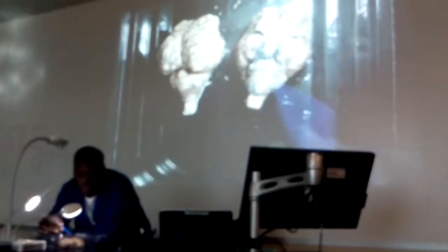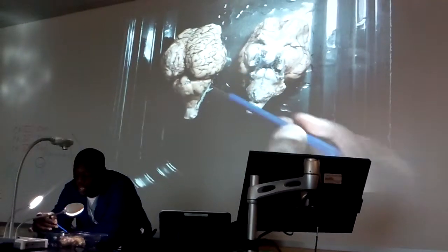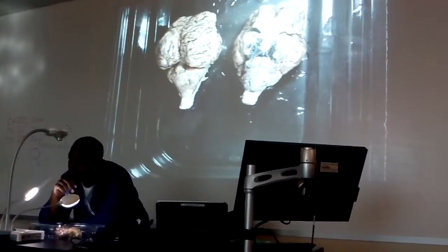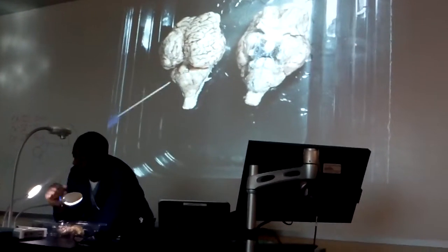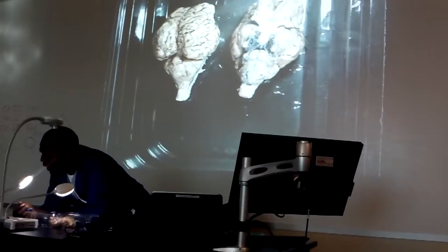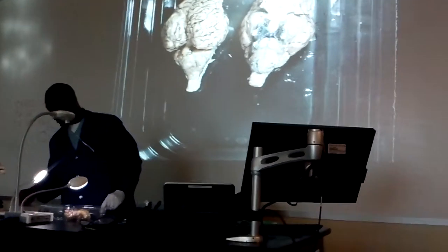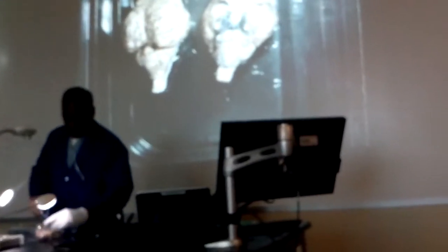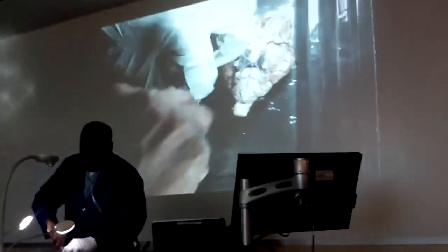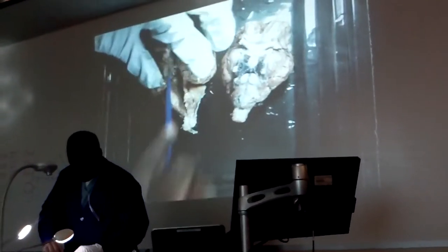So do it again. Frontal lobe, temporal lobe on the side, parietal lobe, and occipital lobe. Those are my 4 lobes. Mr. Gilmore, that sounds just like the skull. Yep, because it associates with the parts of the skull. Now, if that much is true, it asks us about corpus callosum and lateral ventricle and all that. You can't see that from this aspect. So what you got to do, Mr. Gilmore? The only way for you to see that, you got to divide the brain into left and right. That's the only way.